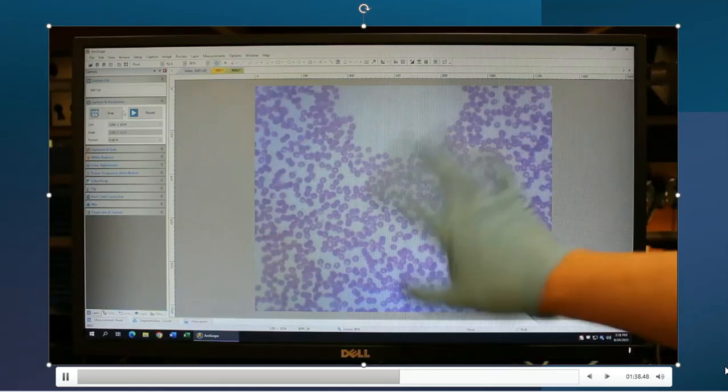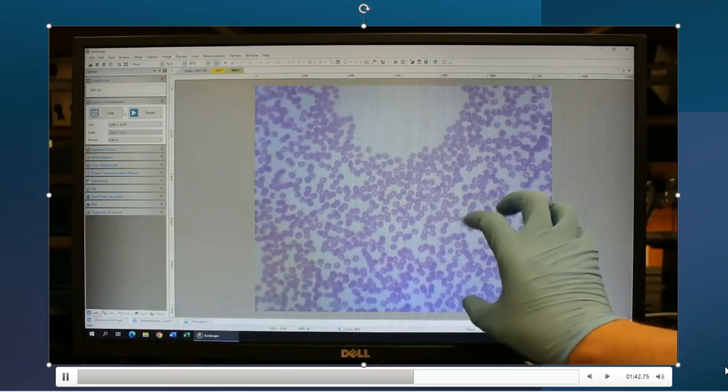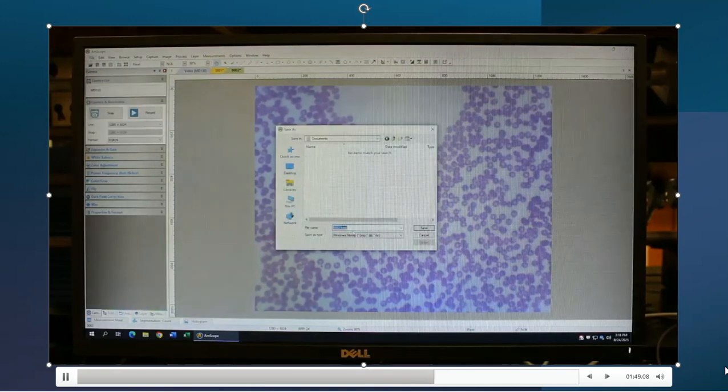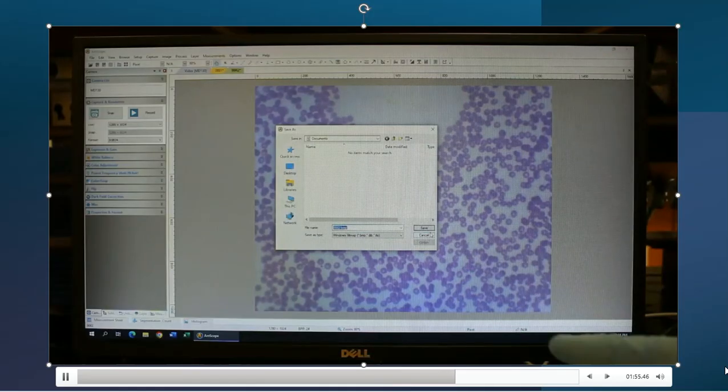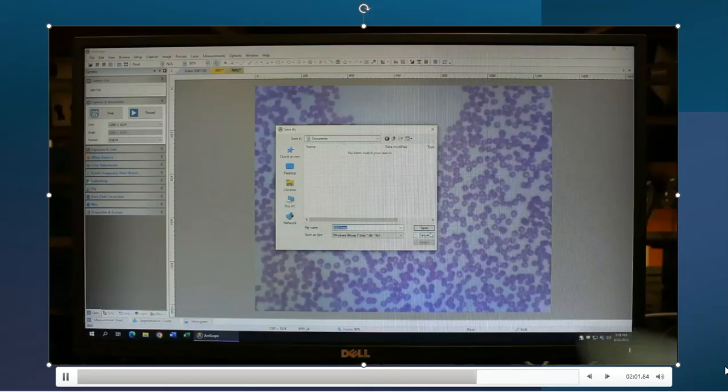I feel it everywhere. All right, so here is picture 0002. And again, that is a picture. It is there. I just need to go up to the top corner, do File, Save As, and save it as something that you know. So, my initials TH, and then the blood slide here was number 10. So TH10, and then I like to put the lens number after it. The first one was 4, and this one is 10.